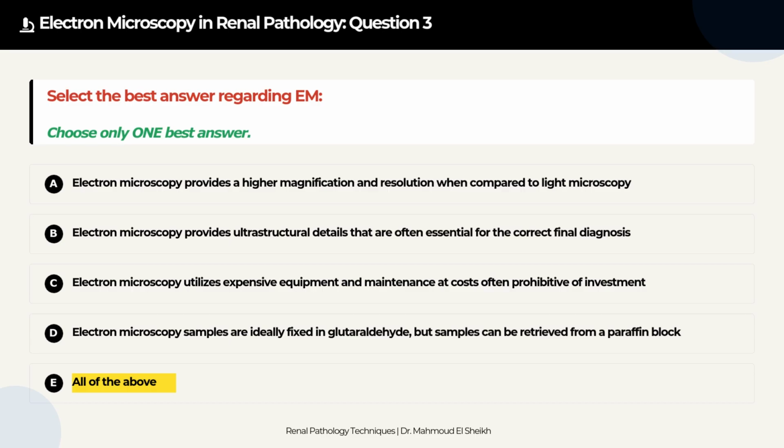The traditional high voltage EM technique still provides better quality of final images than low voltage EM, which requires slightly lower initial cost and less space for the equipment. The sample preparation is the same for both techniques. Rapid EM processing can save time but often results in artifacts.